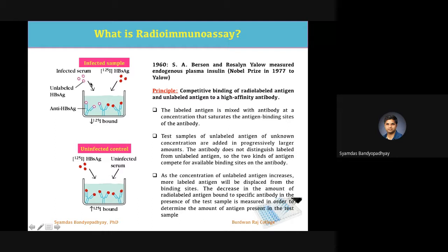Let's say you have done an experiment. So you have injected a certain molecule in a mouse, and then you would like to measure the concentration of one cytokine, let's say IL-10 or IL-12. Now this is the antigen, IL-10 or IL-12. So you would like to measure the concentration of this IL-10 or IL-12 by using this kind of competition, right? So this is called radioimmunoassay. And as you see, because radioactivity is involved, it is called radioimmunoassay.